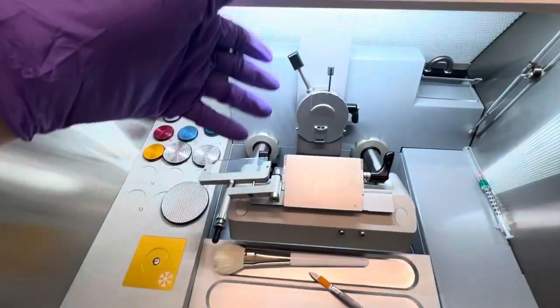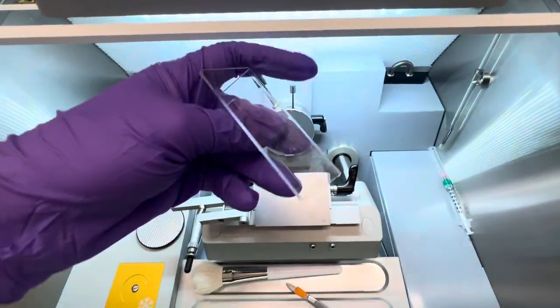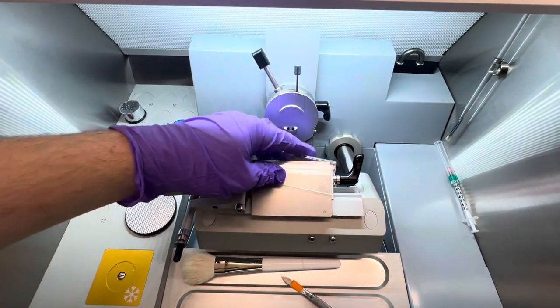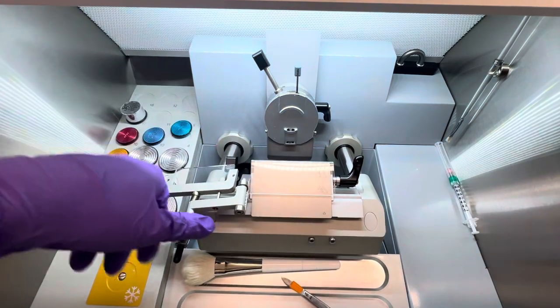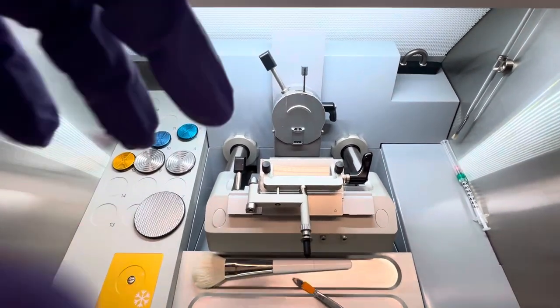There we go. And when you're not using it, like I mentioned before, I have it set up here. Have the good old blade cover. Set it on there so nobody gets hurt. Okay, so that's for that.